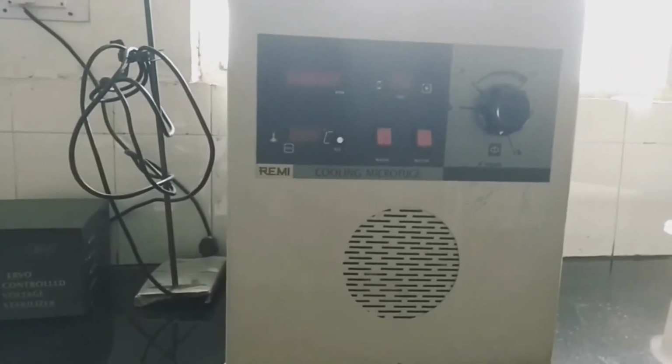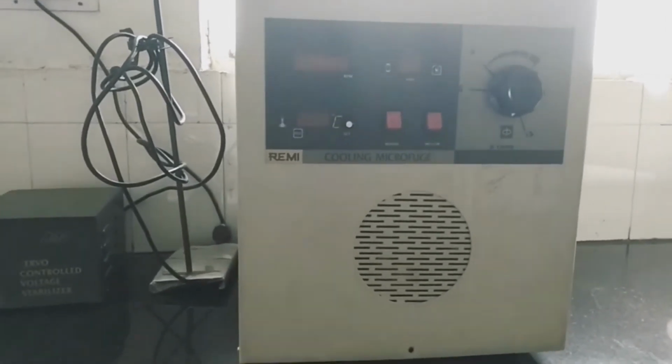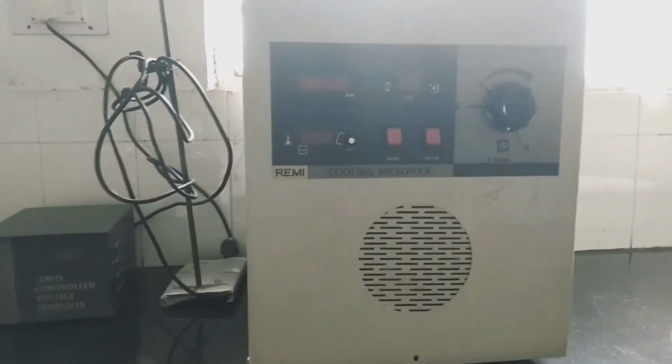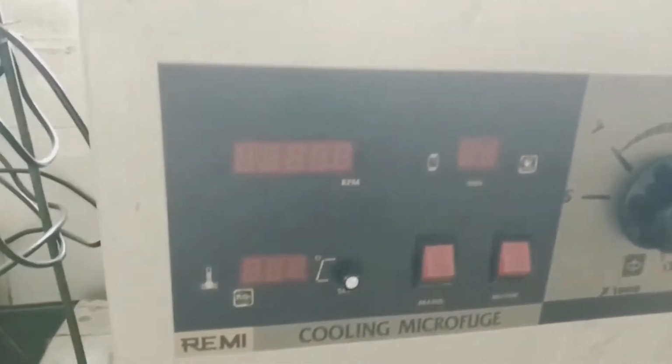We use it for the differentiation of supernatant and pellet in a liquid suspension or liquid solution. It works on different RPM, a higher RPM or a lower RPM, but generally it works on a higher RPM so that we can differentiate between all of that. You can see that there is an RPM meter here. This is the minutes timer which we can set for that. We just have to use it.